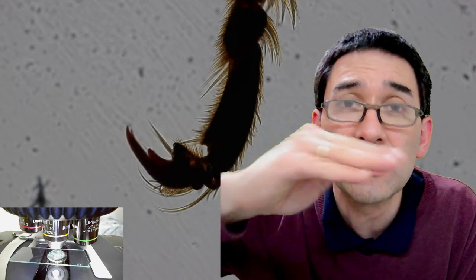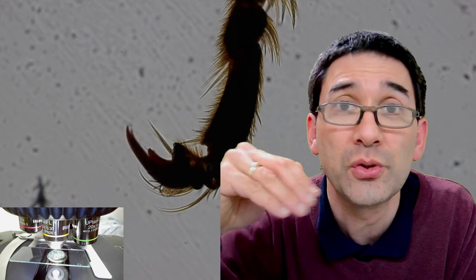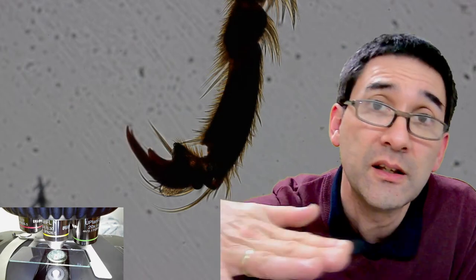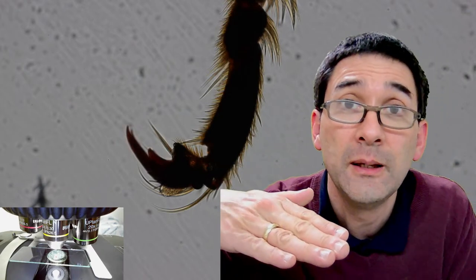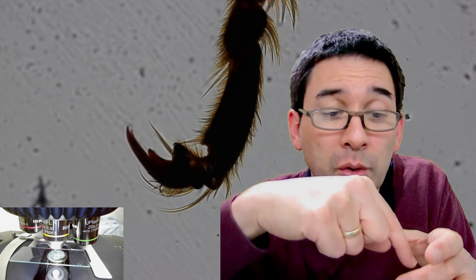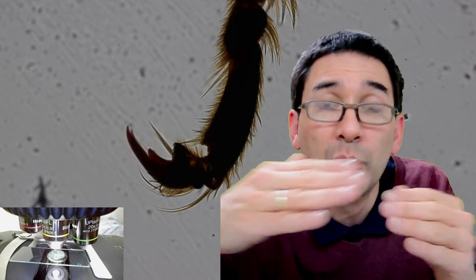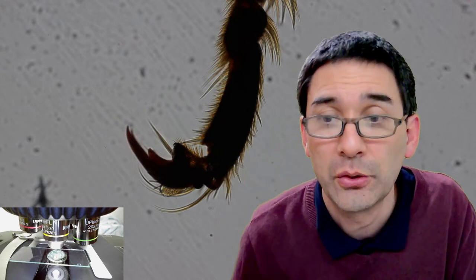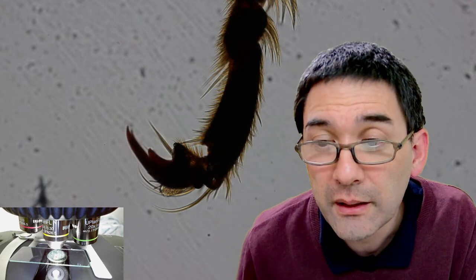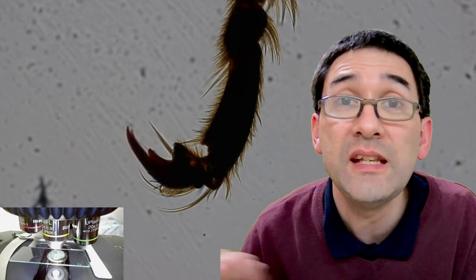And what you want is you wanna make sure that everything is even and flat, because an uneven surface also means that the light is scattered and refracted differently, and this can cause the image not to be so nice. So a cover glass actually makes sure that the surface is flat, okay? Otherwise, in the objective, when you look at it, then the left side is lower, the right side is higher because of the mounting medium not being smooth, and then you don't get a consistent picture, and then it's blurry, okay? Okay. And without a cover slip, you get dust. That's of course also a thing, right? And it's not as easy to clean off.